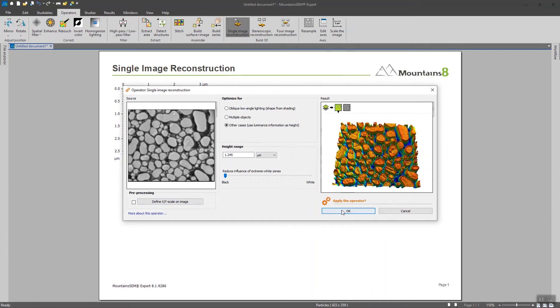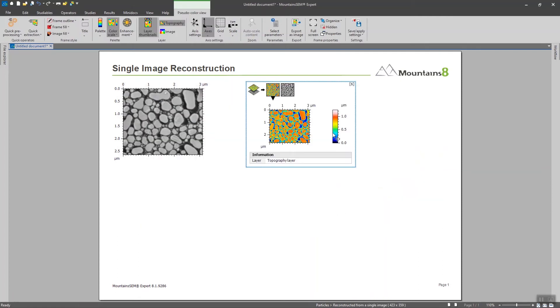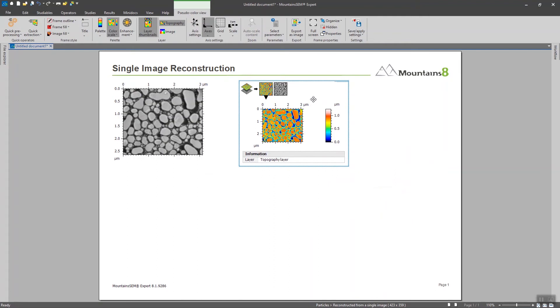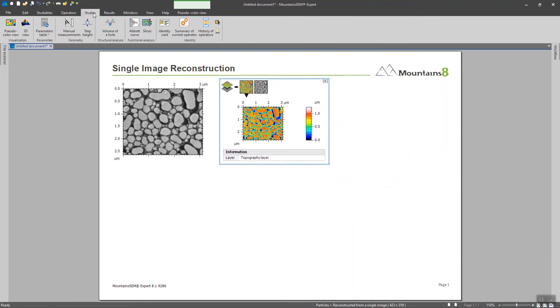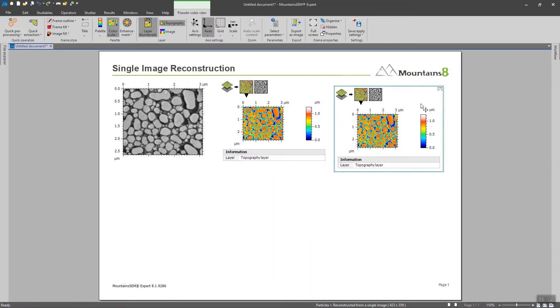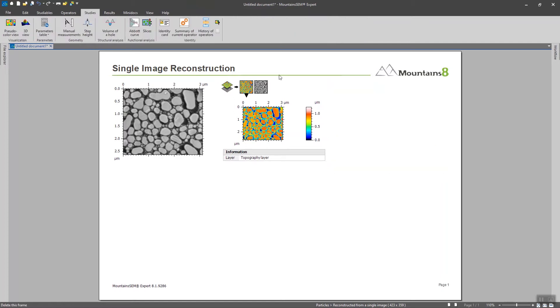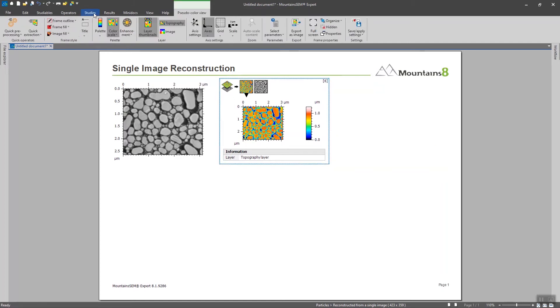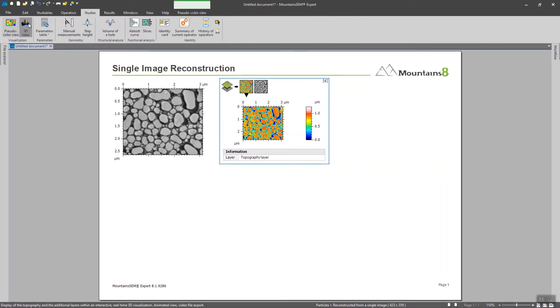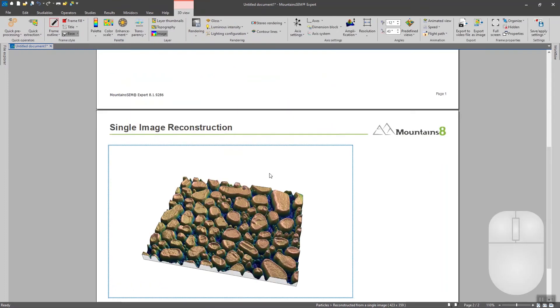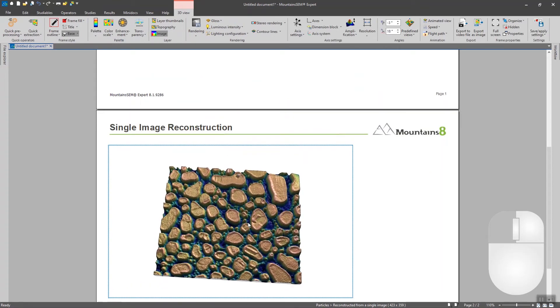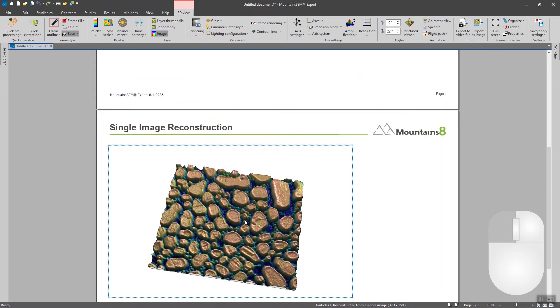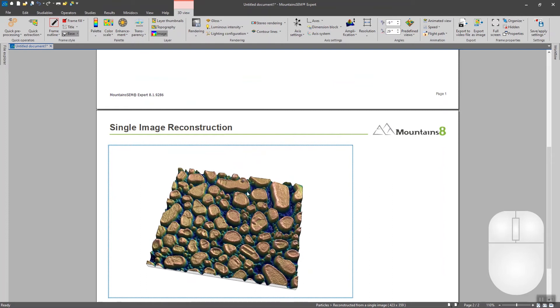So I'm going to click on OK and we can see the 3D rendering of the surface which is pretty nice if we consider the fact that it's only one image.